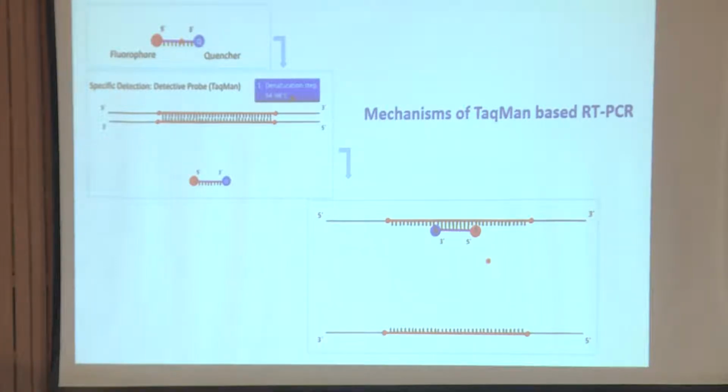You cannot use the same primer. Keep in your mind. Okay. Let's move on. What happens? 2 single stranded DNA. I am just showing one of the strands bound with the probe. Correct? And you may find that primer also is somewhere sitting here. Yes, it should be happening. Let's see.